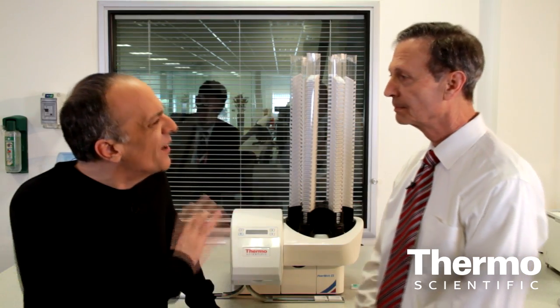Peter, in the histology lab, our customers are facing really enormous challenges. Talk about them. Right now, there are two things impacting them hugely.